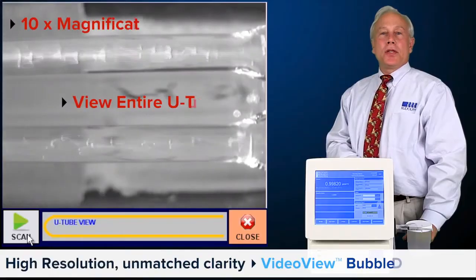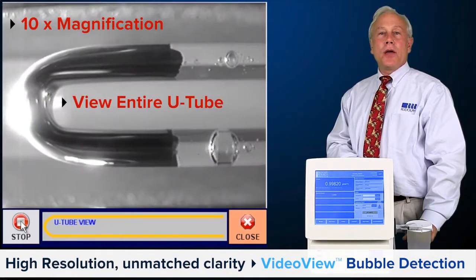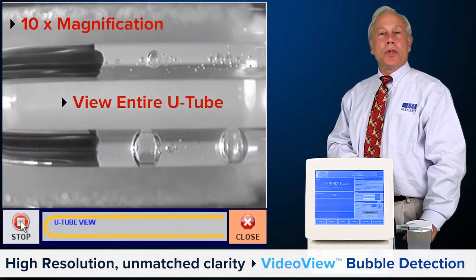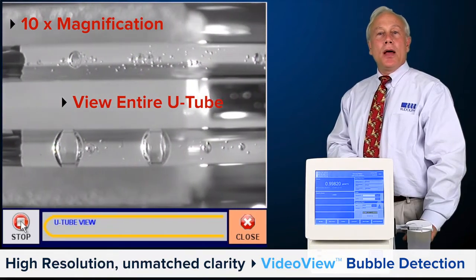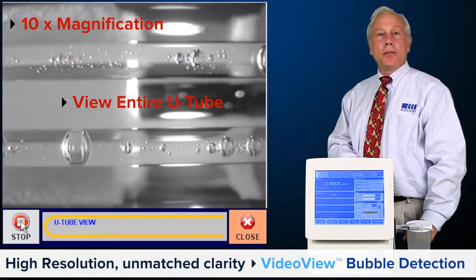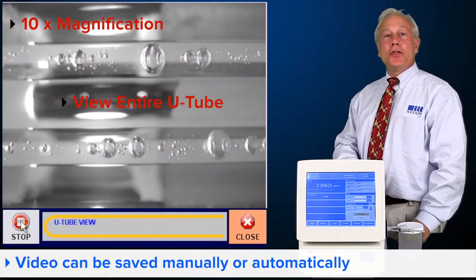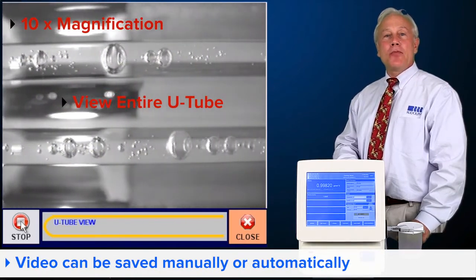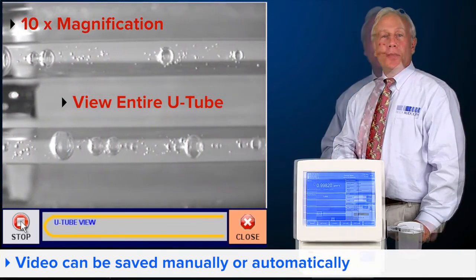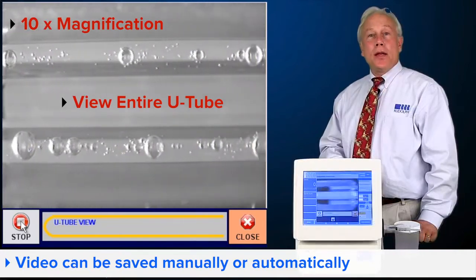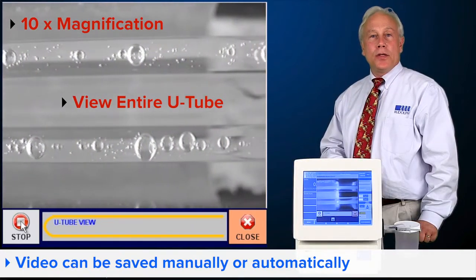Rudolph's exclusive video view provides superior high-resolution bubble detection within your sample with live on-screen video viewing. With its tenfold magnification, the full-feature scanning camera provides a complete view of the sample tube. Either manual or automatic saving of the video is possible.